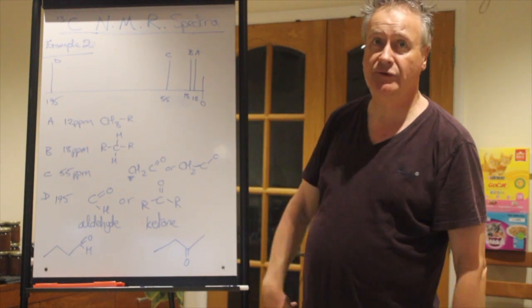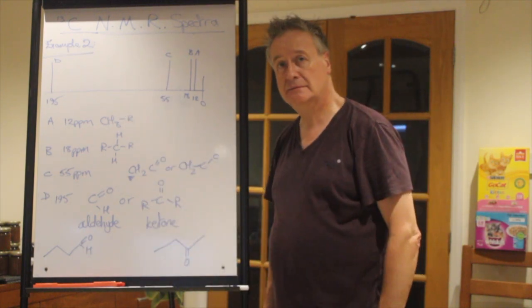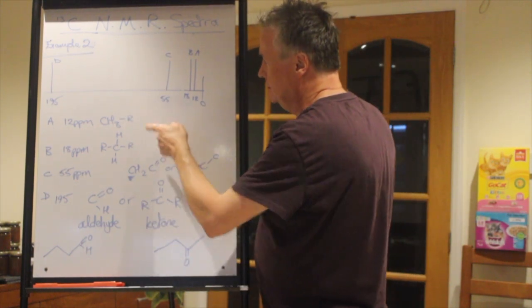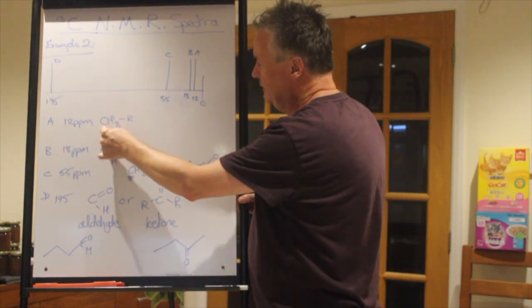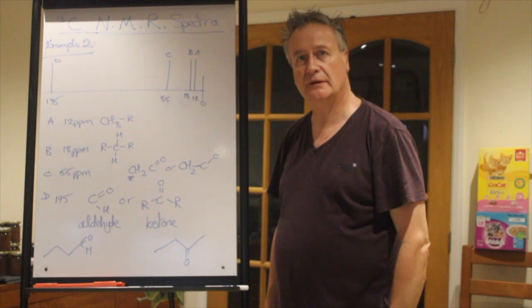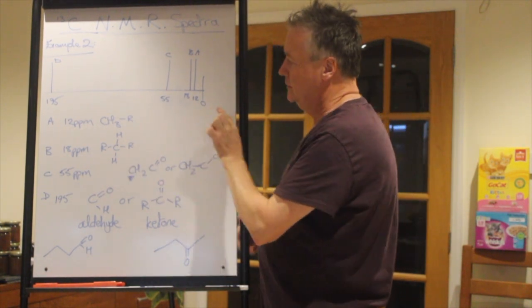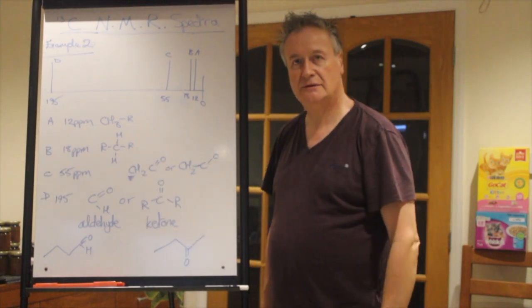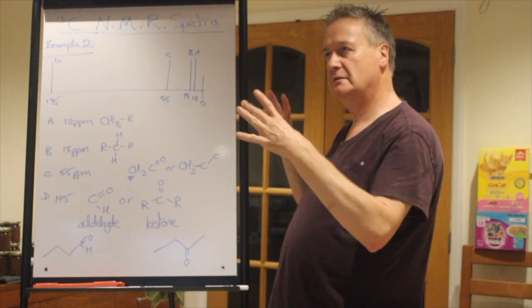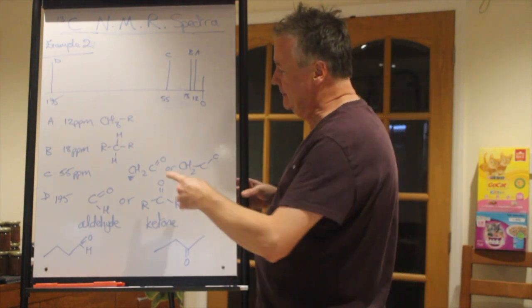So letter them off A to D, analyse them A to D. A, 12 parts per million. It's going to be the CH3 attached to some other part of the molecule. B, slightly further over, happens to be that there, a CH2 group with normal carbon chain either side.